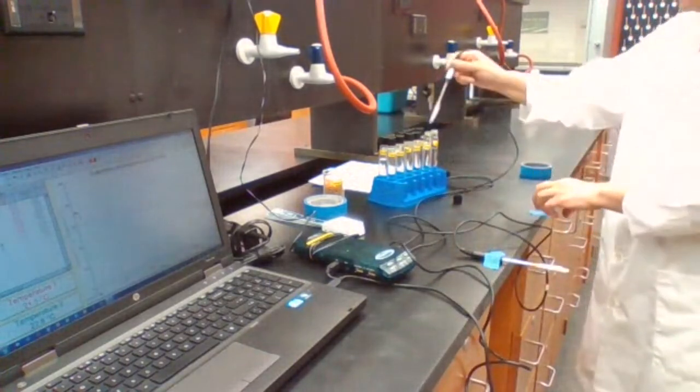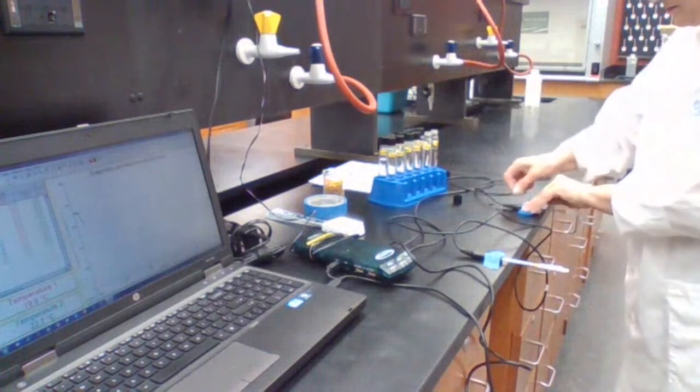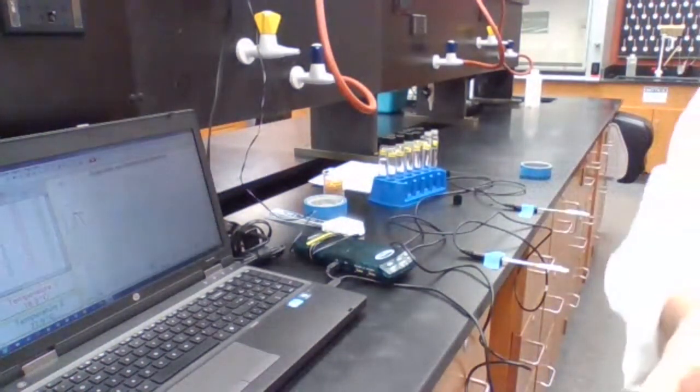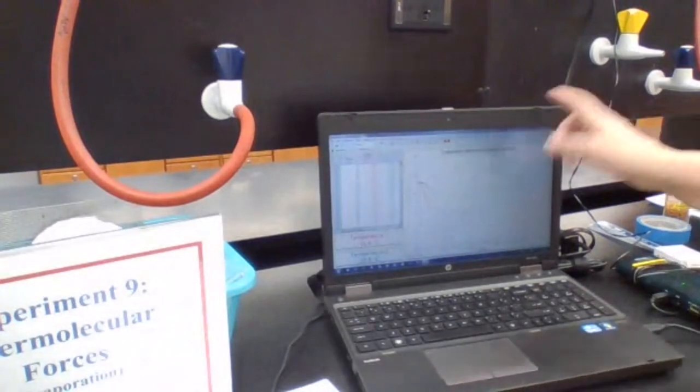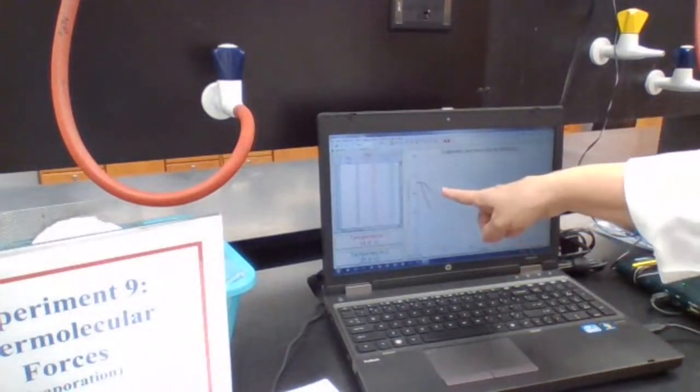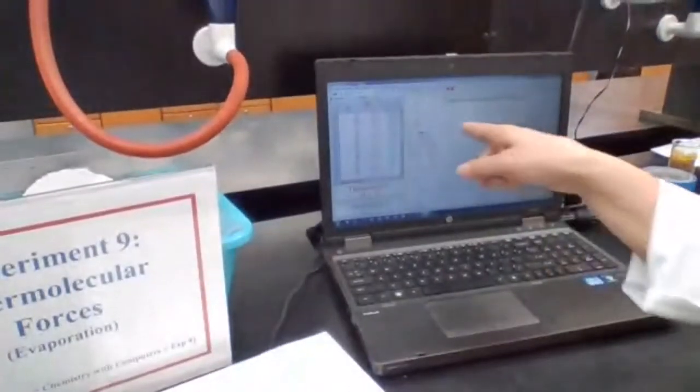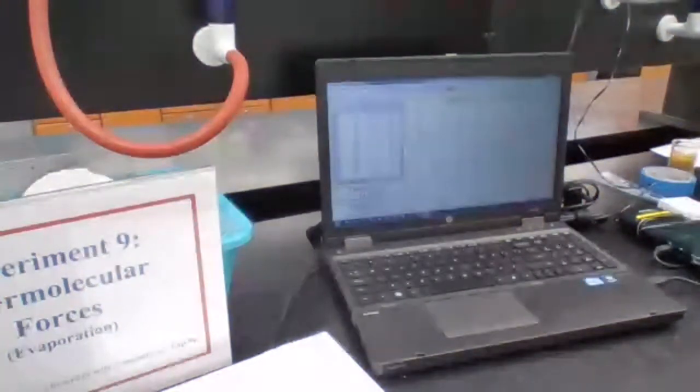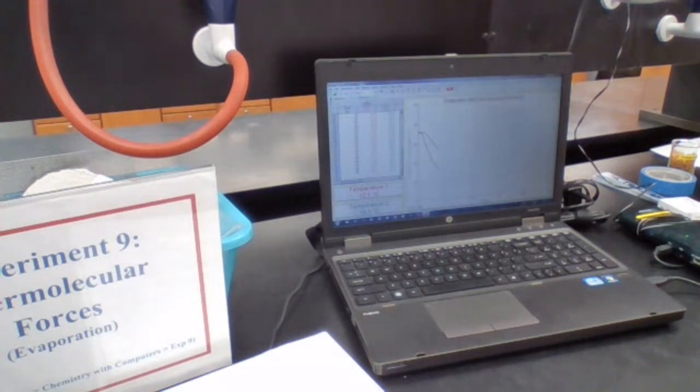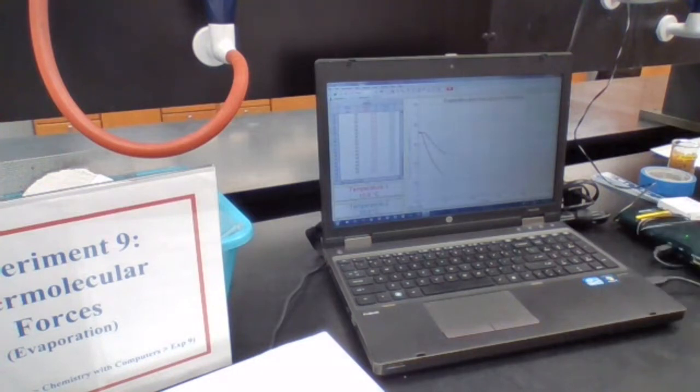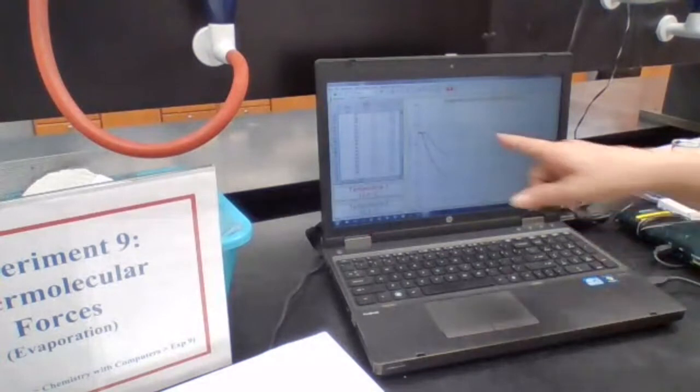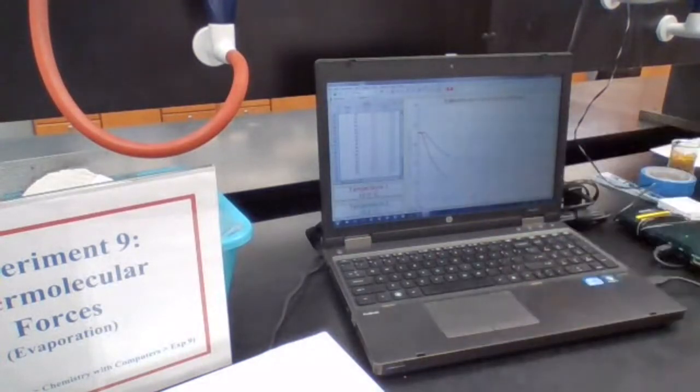It's more obvious with the lines than the numbers. At least you could see the temperature is dropping because what's happening now is the liquid from the filter paper is evaporating and the thermometer probe is recording the temperature. Because evaporation, as I said earlier, is endothermic, it removes heat from the environment and it makes the filter paper cold. So dropping temperature is evident here on the screen.